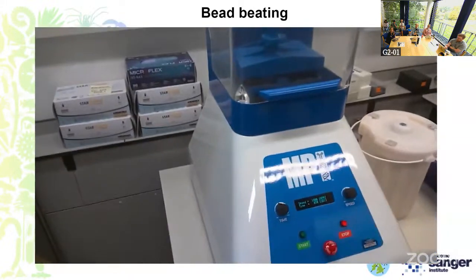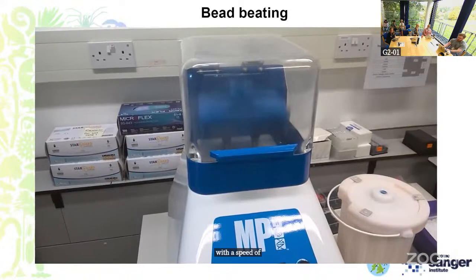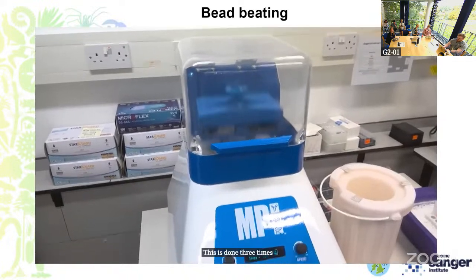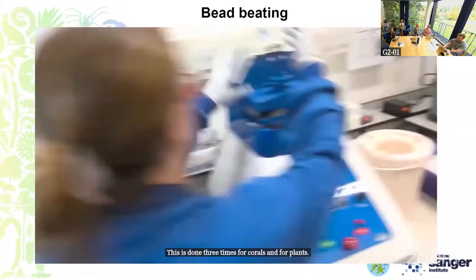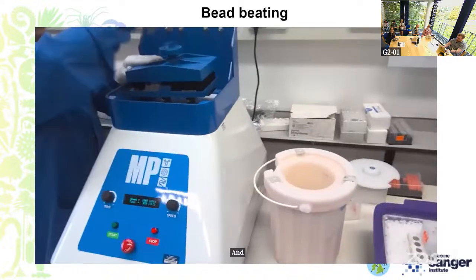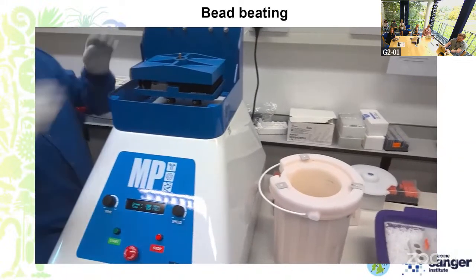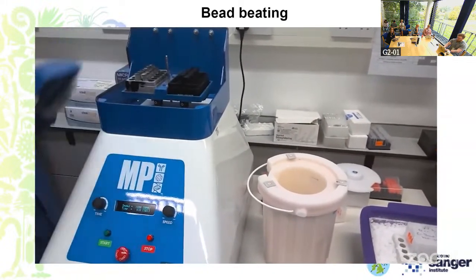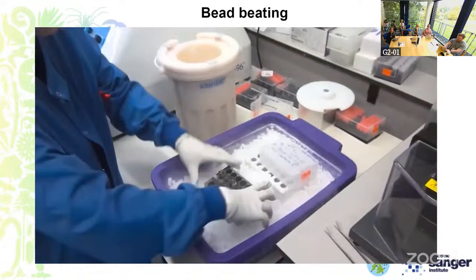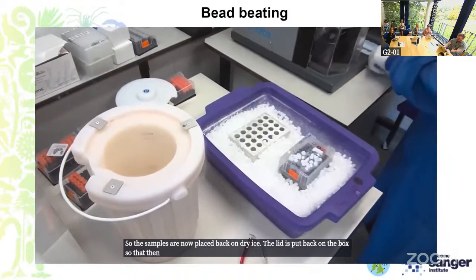Lid closed, and I now start the fast prep with a speed of 1800 running for 30 seconds. This is done 3 times for corals and for plants. The reason we run for 30 seconds at a time is because the samples heat up during this process, and it's really important to cool them down again before each interval. The samples are now placed back on dry ice. The lid is put back on the box so that then they can be resubmerged within the liquid nitrogen.